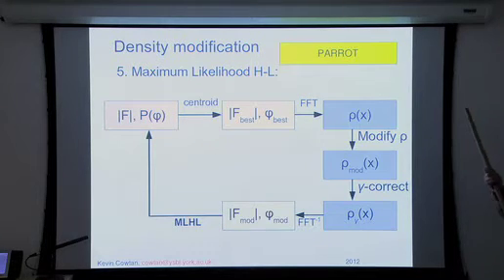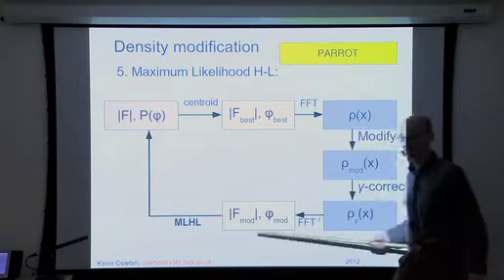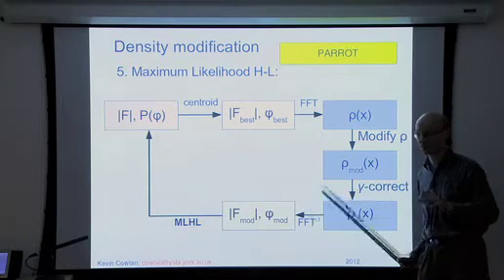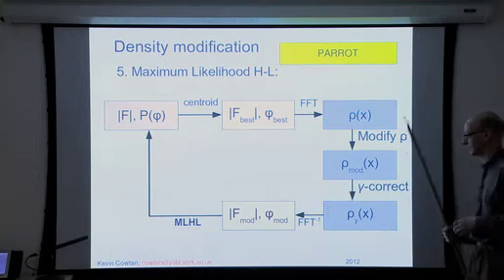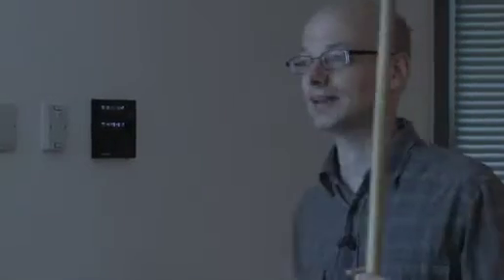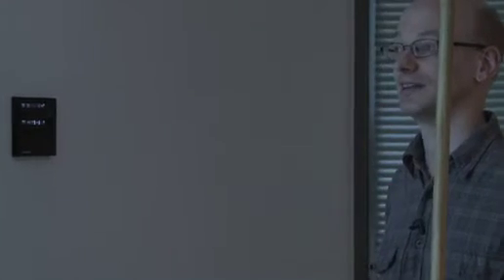There's been one more recent development which goes into my program Parrot, which combines these steps that were down here into a single step using the same kind of mathematics that's in Garib's program RefMac, and that improves things a bit further. It just throws a bit more information at the problem. There's one further development in the pipeline coming from the Leiden group, but that's the state of the art for most common purposes.